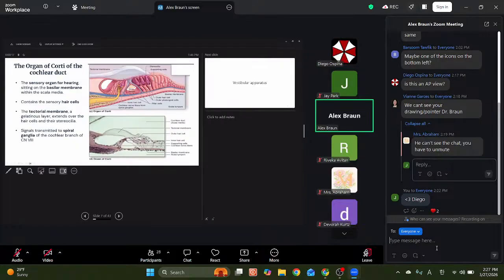Okay, so this is just an organ of Corti at higher magnification. It's this area of sensory epithelium. It's actually a transverse section here, but it's actually a spiral in three dimensions, and it's complicated, but to make it simple, it consists of hair cells, which are the sensory cells, and support cells. That's basically it, hair cells and support cells.